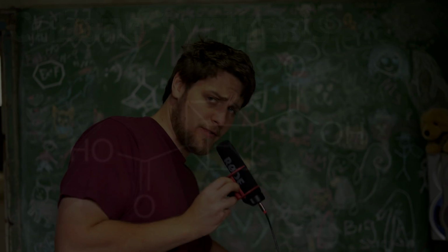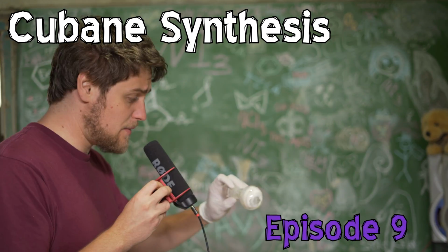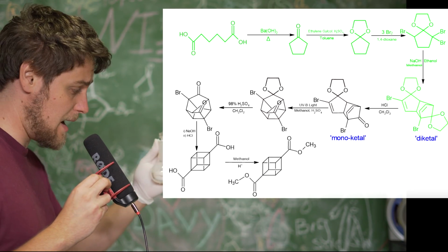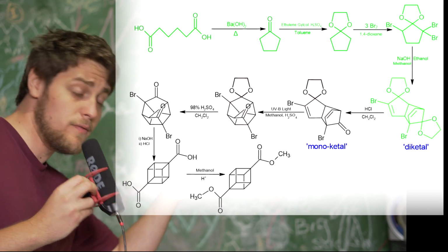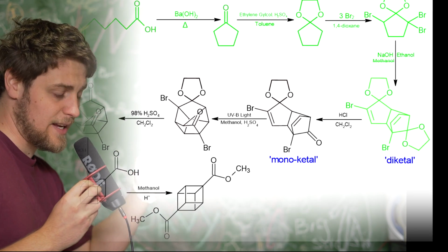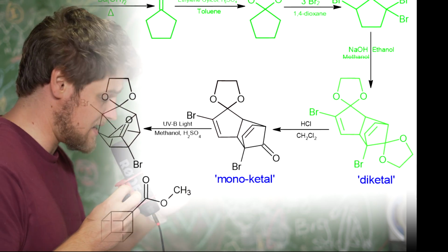Right, so last video, which for me wasn't very long ago, but for you guys would be quite a while ago, we were trying to make the MonoKetal. Trying to remove one of the protecting groups from our diketal, and then we can use this MonoKetal in the UV step rather than taking off both protecting groups. We're taking off one just because it'll act nicer in the UV photolysis step, which is our next step after this one.